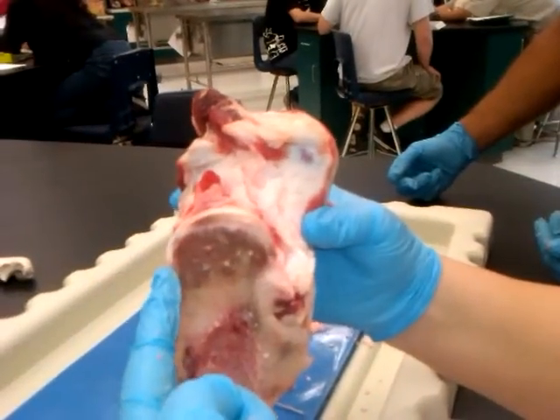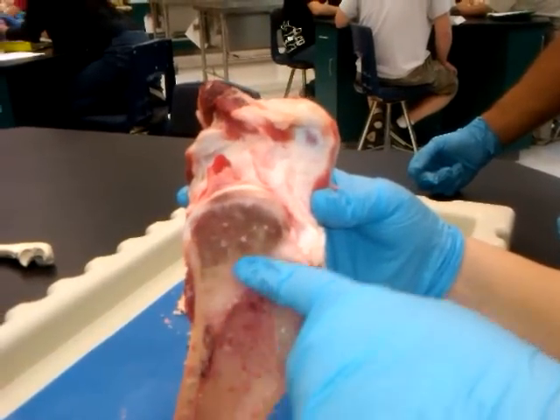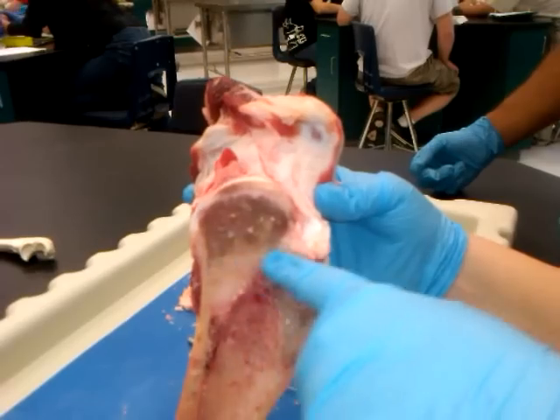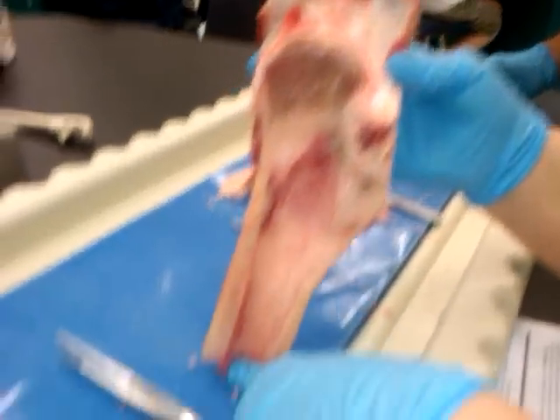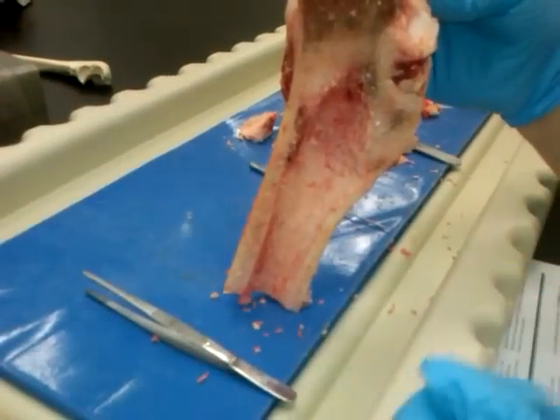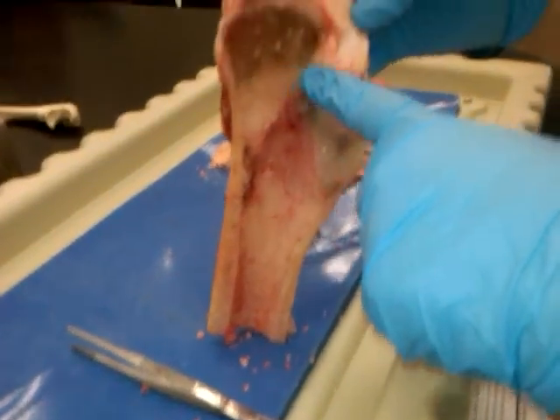And this area is the epiphysis. You can tell right here from this line — this is the metaphysis, and the epiphysis. And the epiphyseal line.